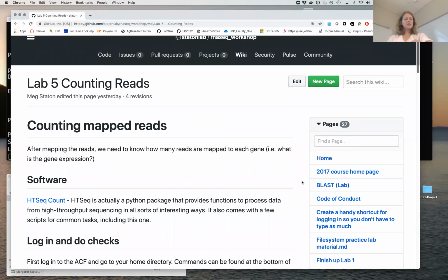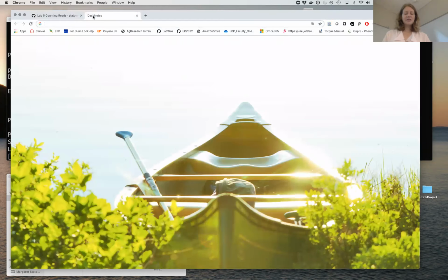And then I'm gonna go copy that qsub command. Usually at this point in the course, I have it memorized, but this one is so long, it's not happening.